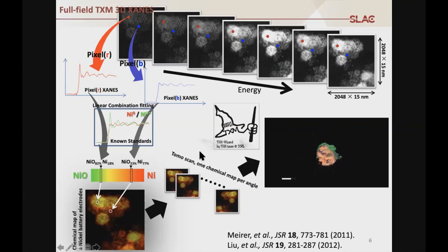I should again highlight here that this is full field imaging combined with the spectroscopy scan, so that we can get about 4 million pixel spectra in something like 10 minutes. Now, if you combine this with tomography, then you get a billion spectra, 1K by 1K by 1K pixels, in about 10 hours. So there's a lot of information, a lot of data, waiting for us to extract.